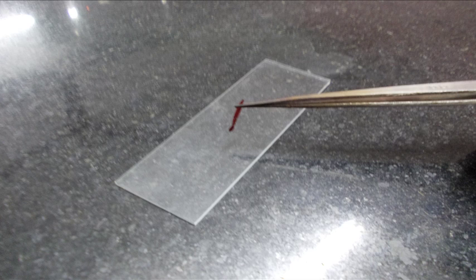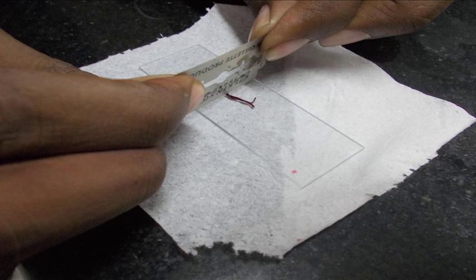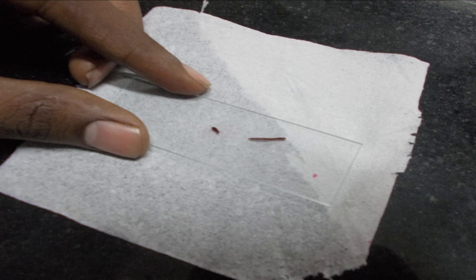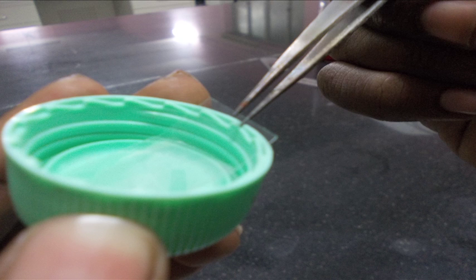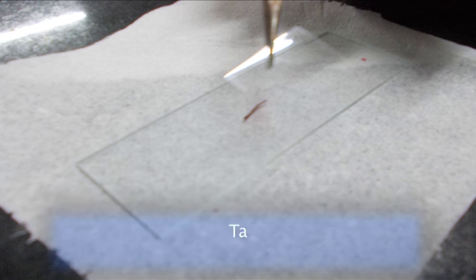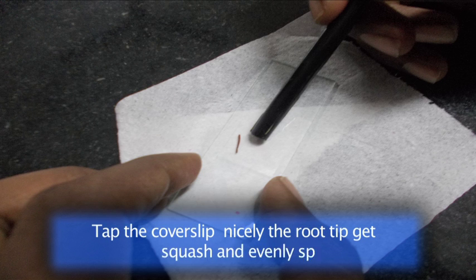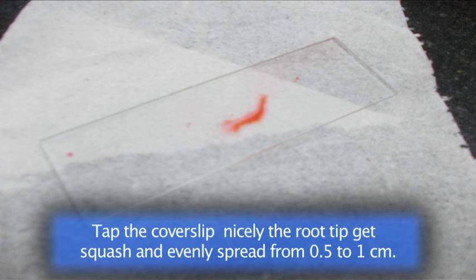Using forceps, take the root and place it in a microscopic slide. Cut and remove the unstained part of the root and cover it with a cover slip. Pressing the root tip will spread it out to a diameter of one centimeter.